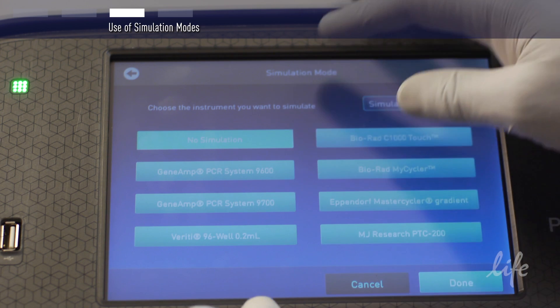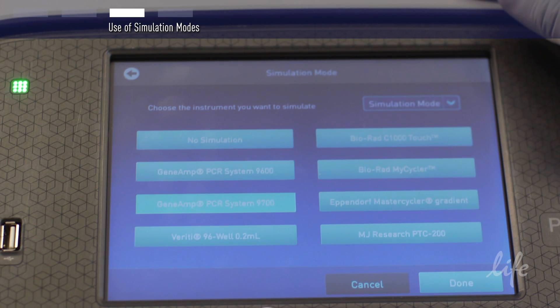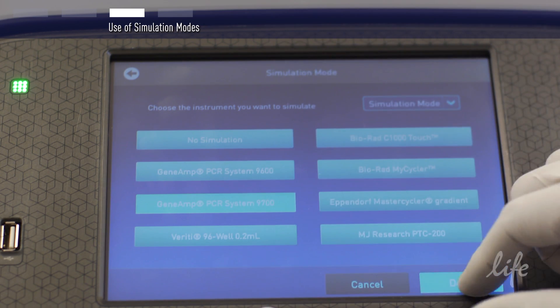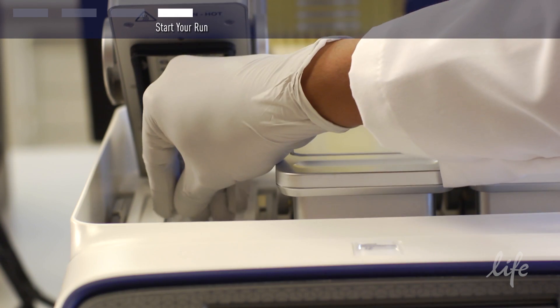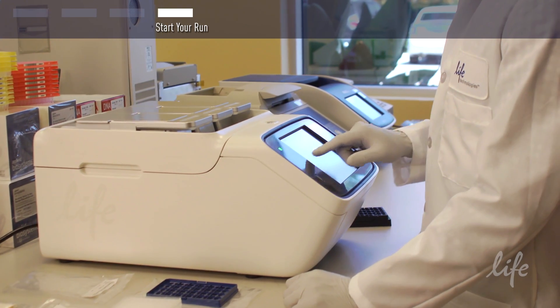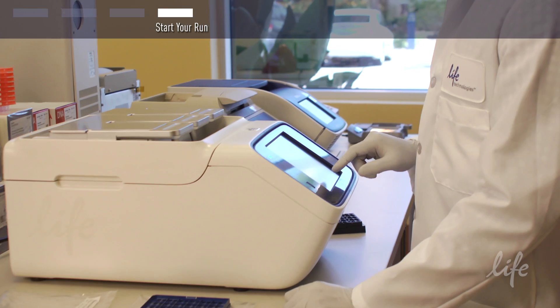Save your method if you are interested in accessing these conditions later. You will be asked to confirm the block you will be using as a final step. Prepare your samples and load them into the block, then press the Start Program button and your run will begin.